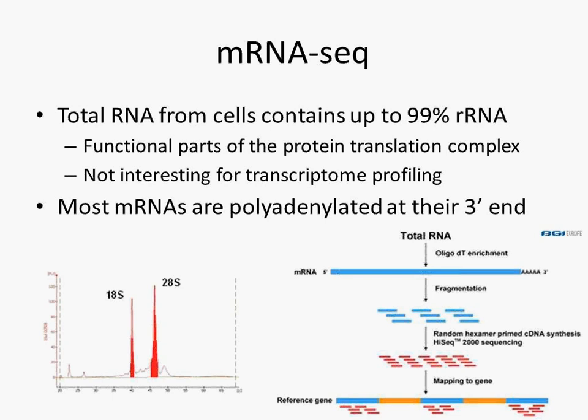But these methods, while they do work for capturing the entire non-ribosomal RNA transcriptome, add significant cost because of the number of different RNA species that are captured that are not adenylated, that are in the process of being spliced. We recover a lot of intronic RNA, so this requires a lot of additional sequencing to get read depth for all these species.